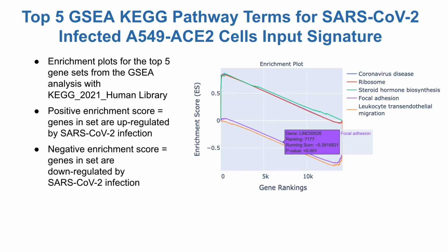Now moving on to the enrichment plots for the case study. There is a drop-down menu, not visible here, for the user to be able to choose which gene sets plot they want to view, as well as multiple interactive features such as panning, zooming, and these hover labels. This figure shows all of the case study's top gene sets together.